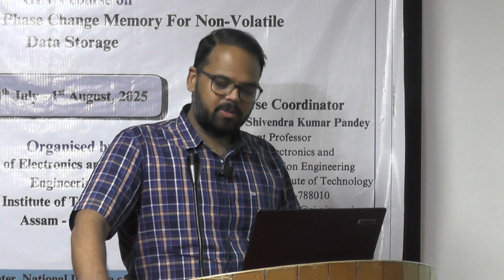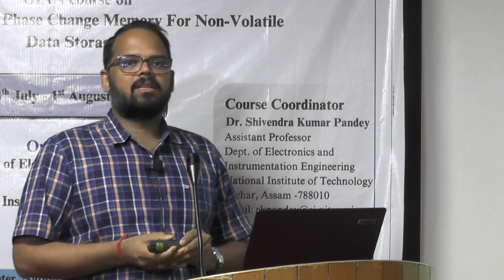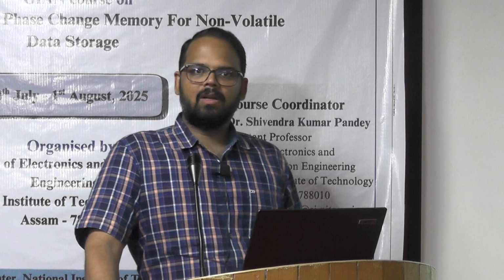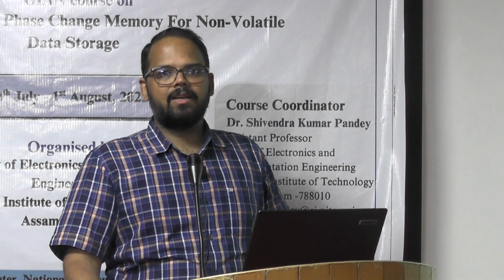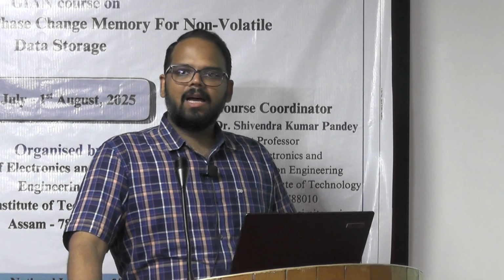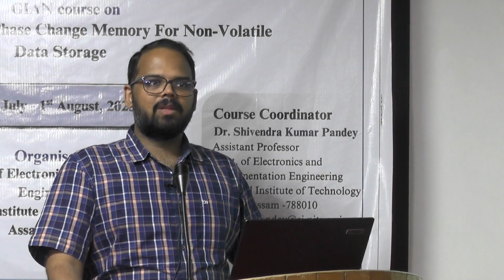This is based on tutorial. So in this tutorial, we are going to discuss about thin film deposition, how you can make a thin film, first of all. What are the equipment currently which we have here? On that you can see the facility and how we can make the thin film based on these chalcogenide based devices. And if we want to take their resistivity measurements, how we can perform that.